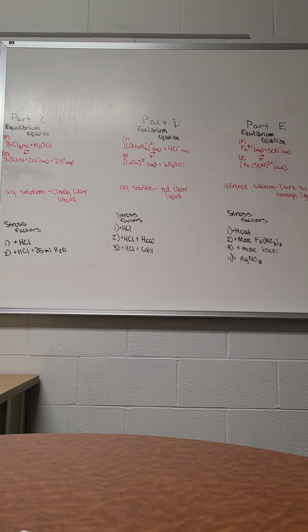Now when HCl and heat were added, that red liquid turned into a more vibrant blue liquid. It almost had more of a deeper blue tint to it rather than more of a dull blue. Now, when the solution had HCl and was then cooled, it was a violet, gray, and very dull liquid.